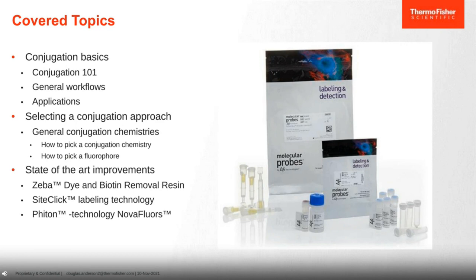And then lastly, I'm going to be covering some of the state-of-the-art improvements in conjugation chemistry, both some products here at Thermo Fisher Scientific, some workflow improvements, and some products for purchase that have really pushed the boundaries of conjugation chemistry in general, and pushed the bounds of what you can do at the bench and in your experiments, to really get you premier reagents to give you the best success in your next round of experiments.